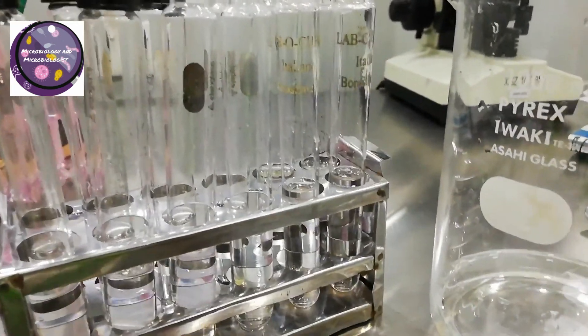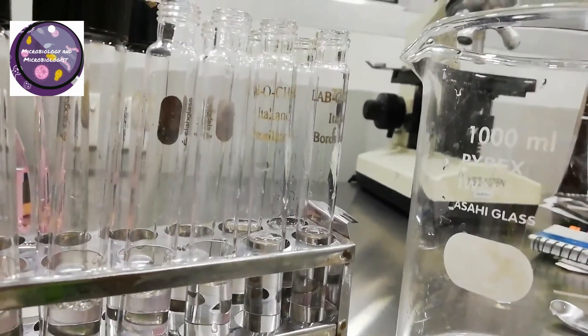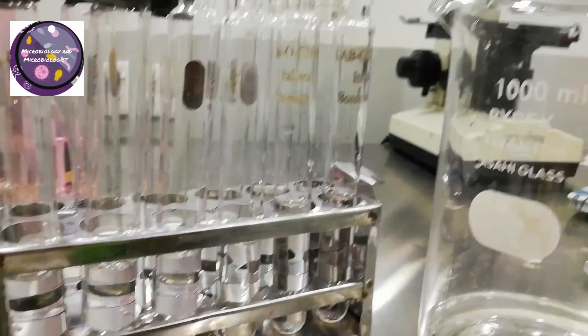After that, I will sterilize all these tubes in an autoclave at 121 degrees Celsius for 15 to 20 minutes, and we'll use it for culture suspension or for serial dilution.